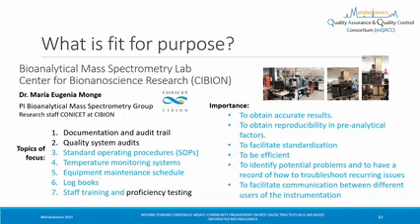Things that I think are less of a focus in the typical academic lab: audit trails, right? Because in some cases, I don't know how big your lab is, but in some cases, the audit trail is knowing who ran the project. And that serves the purpose of an audit trail in that kind of organization at that scale. You know that this person was vertically responsible from start to finish.